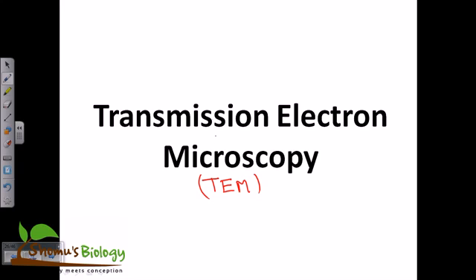microscopy. Now, just like the other type of electron microscopy, in transmission electron microscopy, we use electrons as an illumination source. Compared with light microscopy, because in light microscopy we use light as the illumination source, but in TEM we use electrons for that. The electron beams are used in all the different varieties of electron microscope to illuminate the specimen, and thus it creates an image of it.